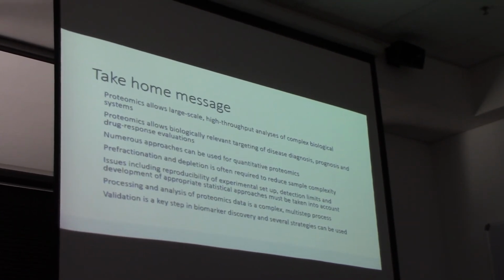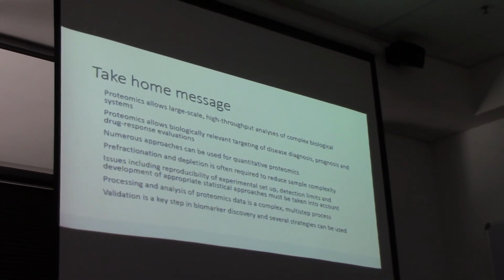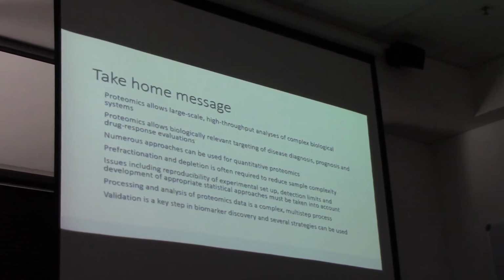Yeah, it's a very complex, multi-step process, and you need to report this in your publication. There's now the MIAPE, Minimum Information About a Proteomics Experiment. Have a look at the MIAPE guidelines. It will help you design your experiments.